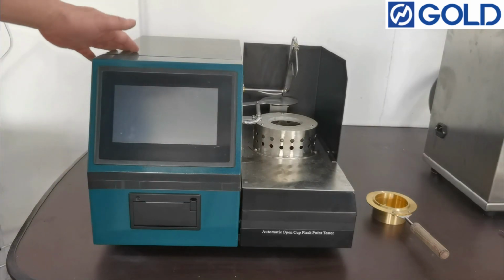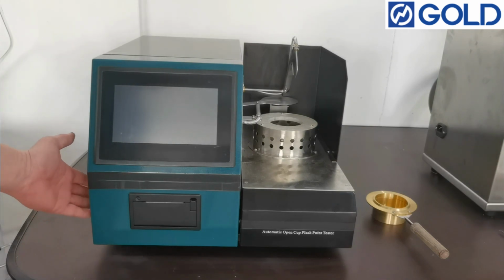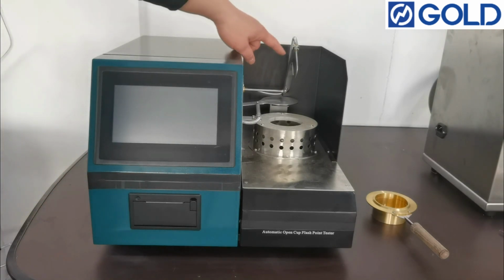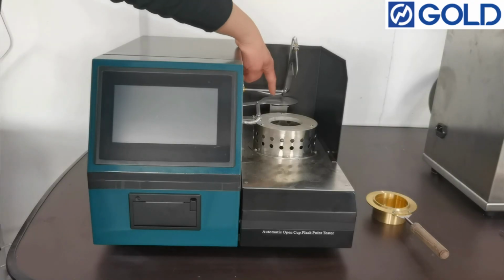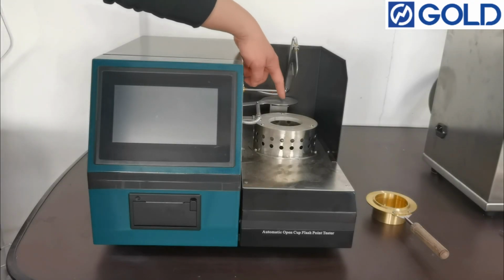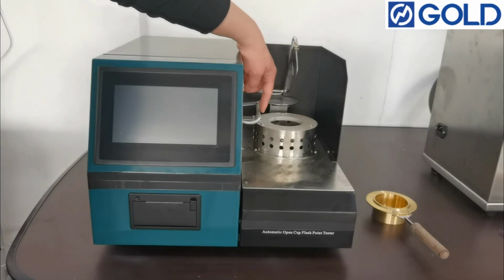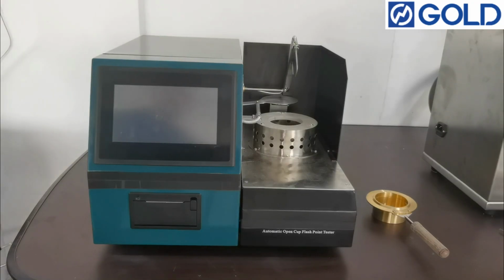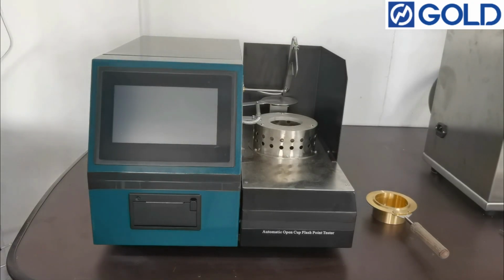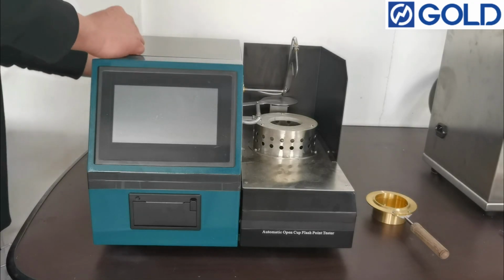ECU, electronic control unit. Power switch. This is the temperature sensor. Extinguisher lid. Heating unit. This is the igniter. Plug the power cable into the back of the instrument.